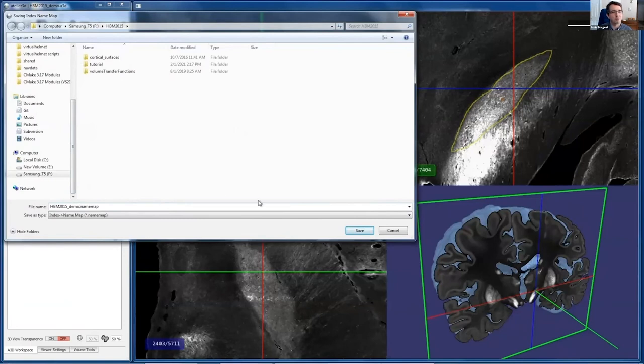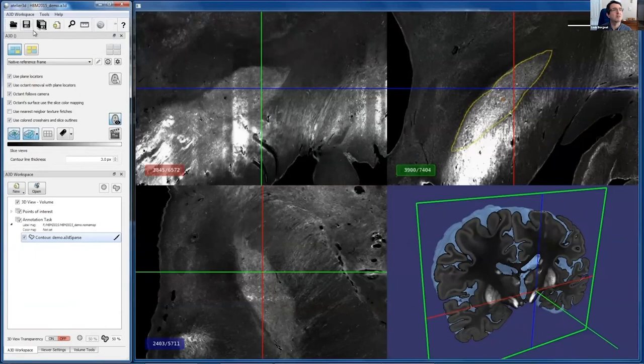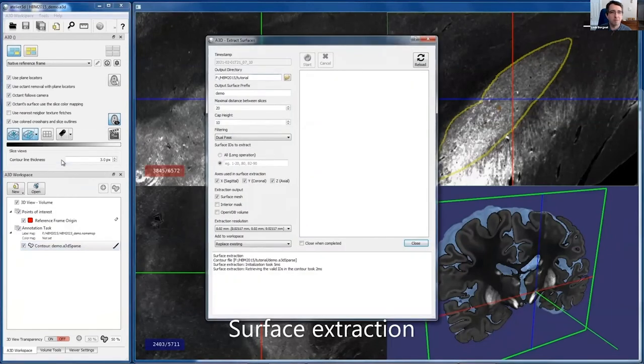So we're also saving the name maps and everything. Yes, when you click that one, apologies, that means saving everything. So there's a button to save only the file you're working on and one to save everything. There is a save as in the workspace, and the software is capable of managing many intermediate results. Don't hesitate to keep multiple versions.